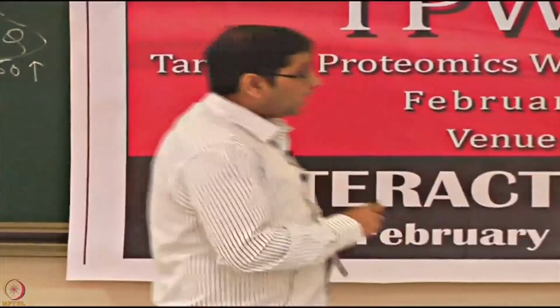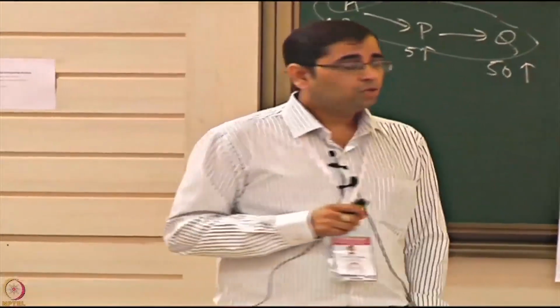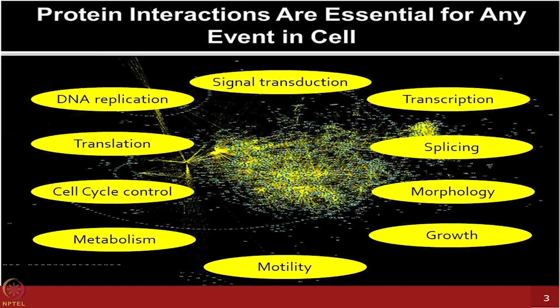I am sure by now you are convinced that these kinds of technologies are very useful to study the entire interactome, which is involved in many important activities, whether you talk about signal transduction, splicing, morphology, growth, metabolism, translation, or DNA replication. These are all pretty relevant for any kind of physiological process which we want to study.